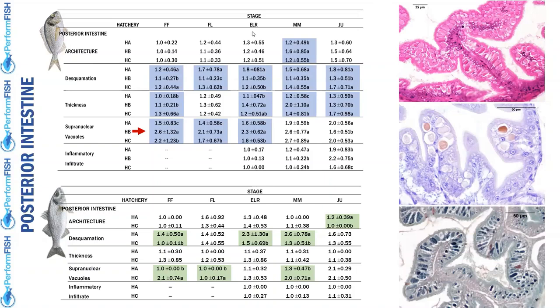Perfect, thank you. Because for histological evaluation, how many fish are necessary to show this? It is not a few fish. In general, when I perform other evaluations, I use 3 fish or 6 fish. But in this case, we have used 20 fish per batch.